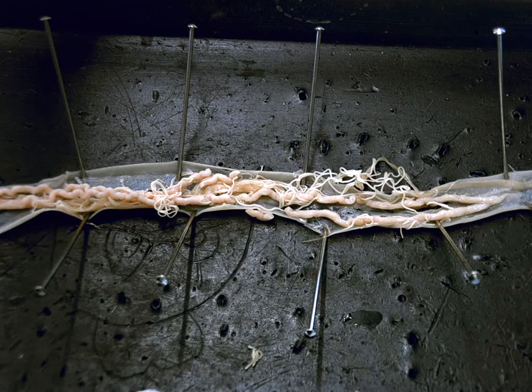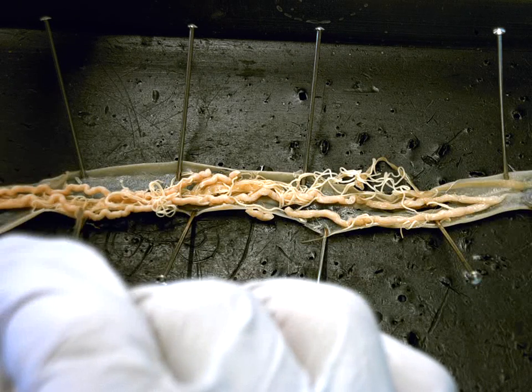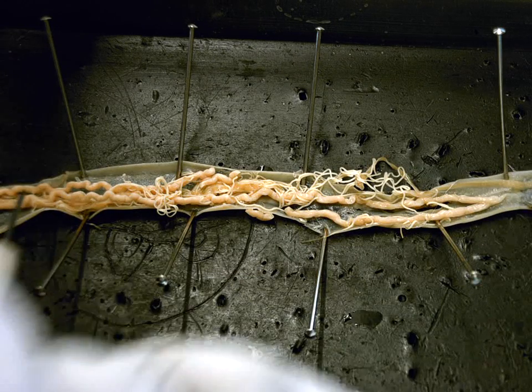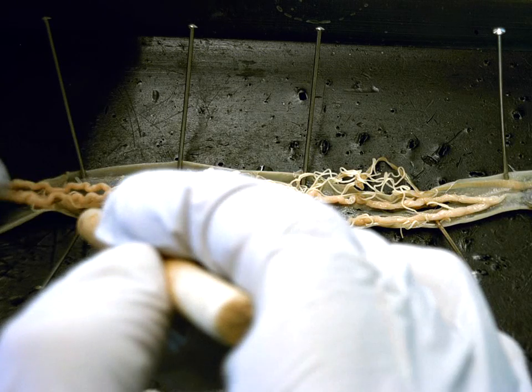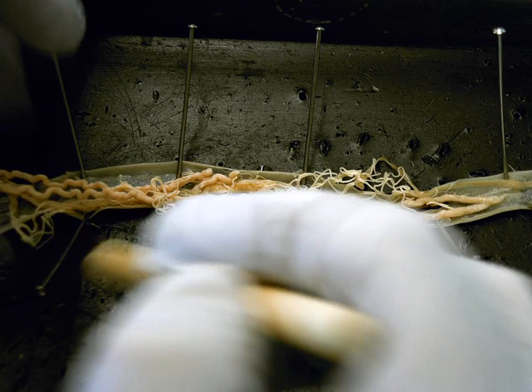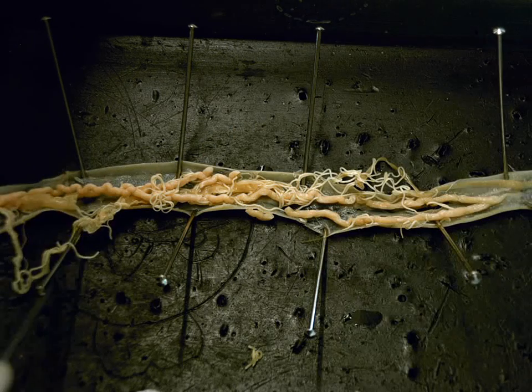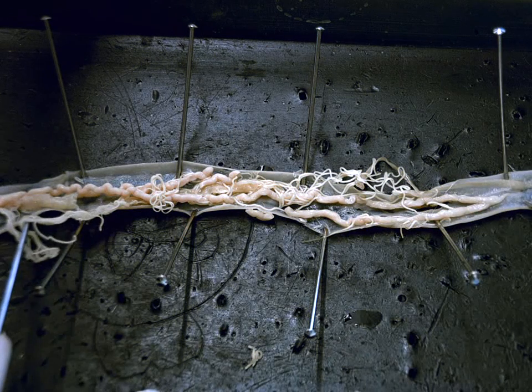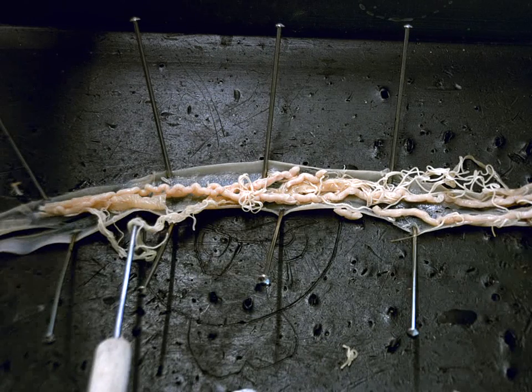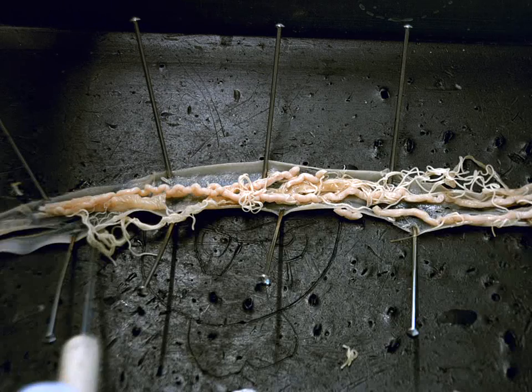That means all these other coily tubes that we can see are all reproductive, because that's the only other thing in the pseudocoelom, or cavity. Now, I know in the notes we simplified the way we draw these, but the way that we know which one is which part of the female system is the thickness or diameter of the tube. So if I pull these ones out from way over here, we can see that these really skinny tubes, see how tiny they are? They're super thin on this left side of the screen. I'll move over a little bit. All of these super skinny tubes would be the first part of her reproductive system, which would be her ovaries.